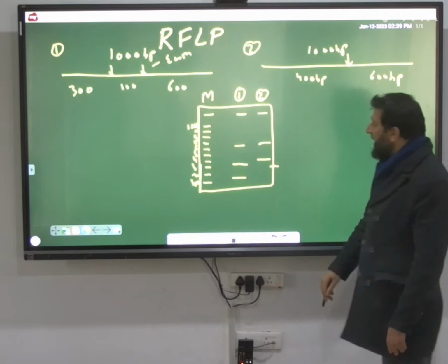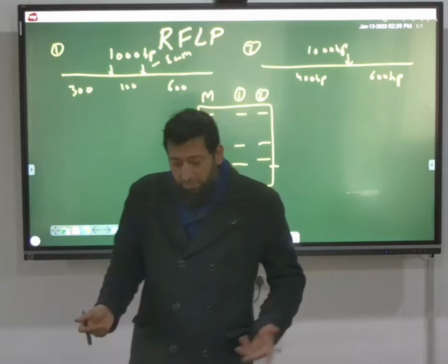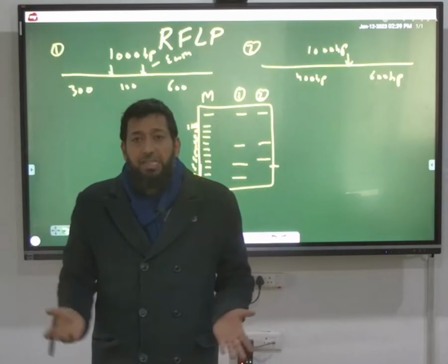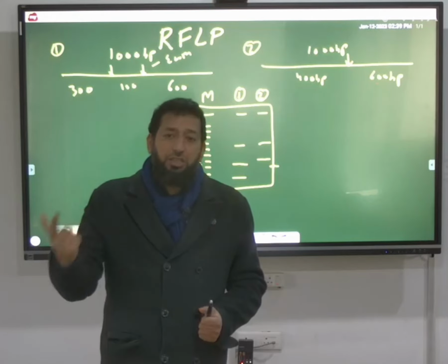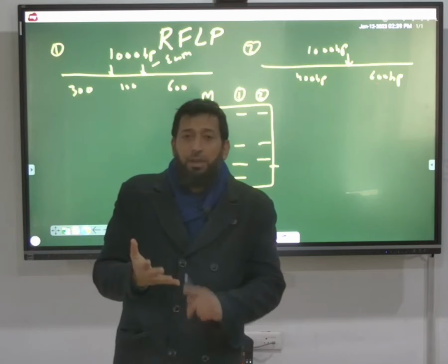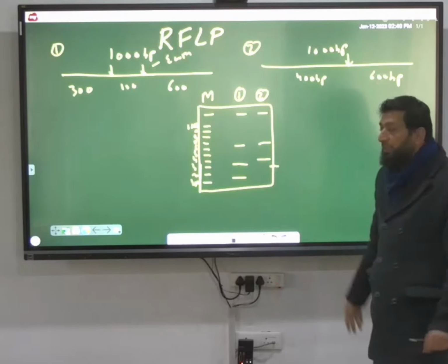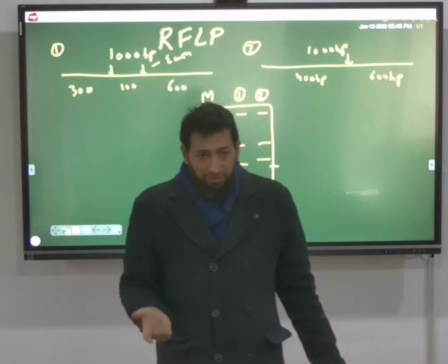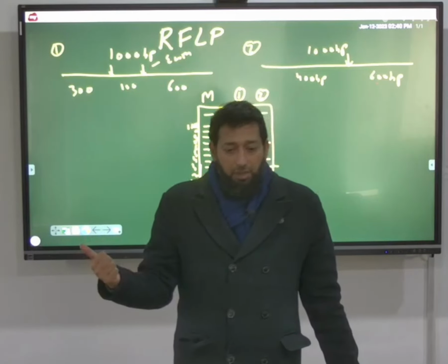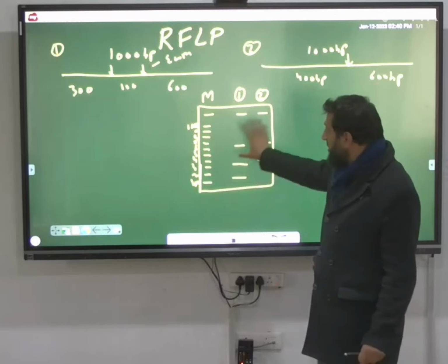here. Now you can see the difference in the banding pattern between these 2 organisms, and what gave rise to this difference in the banding pattern? A mutation at the restriction site. So restriction fragment length polymorphism can tell us the difference between 2 organisms based on either the incorporation of a restriction site or the abolition of a restriction site. So this is the concept.